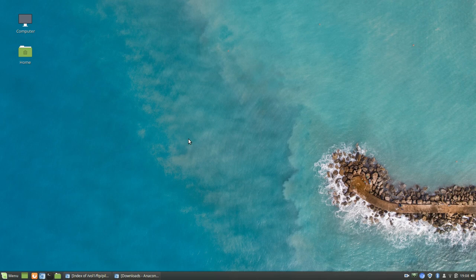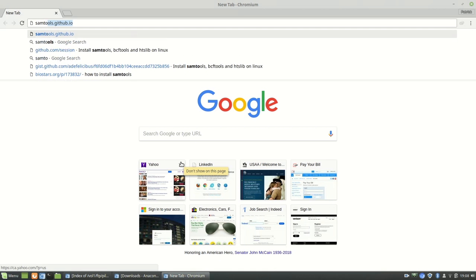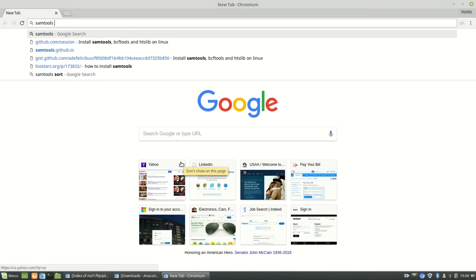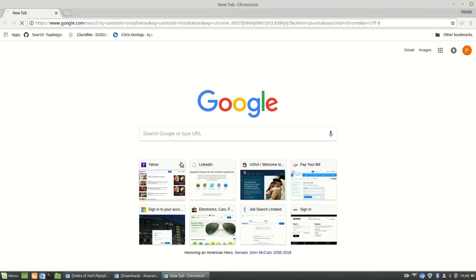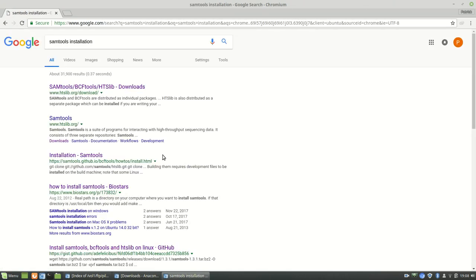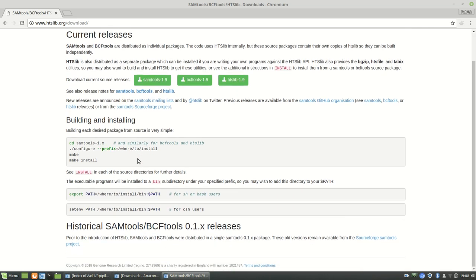If we wanted to install SamTools, you can see here it's a little bit more involved. Building and installing, you have to download, you have to configure, you have to make, make install. It's not too bad, but having Conda available is so much easier.